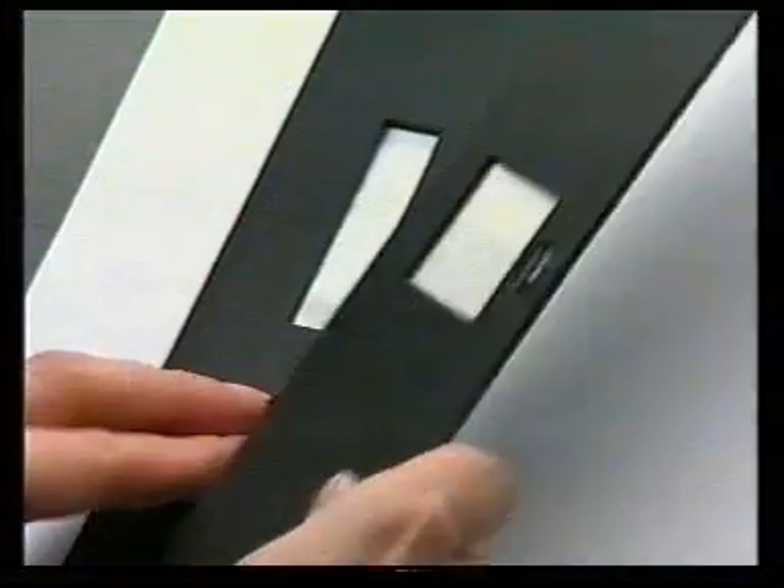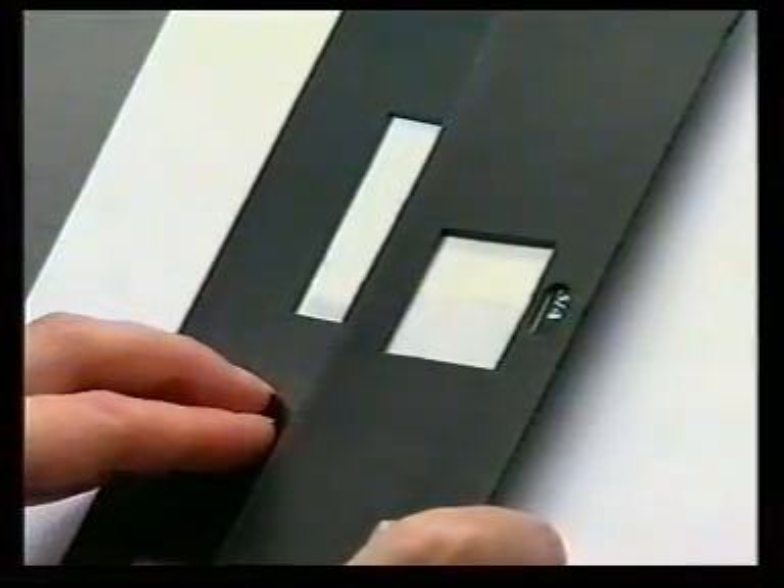When dry, the degree of staining and changing shade is assessed.